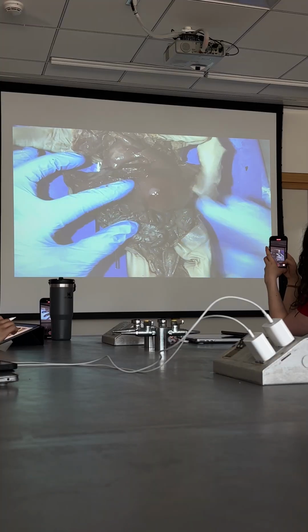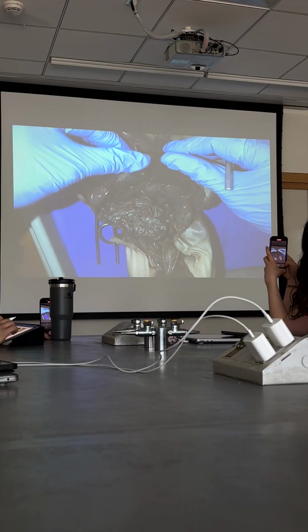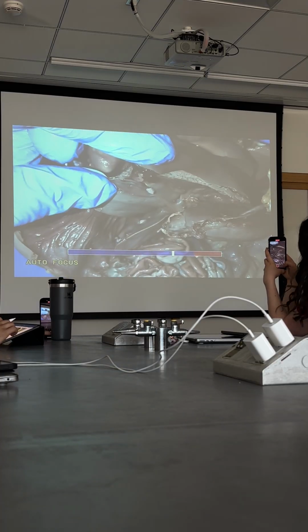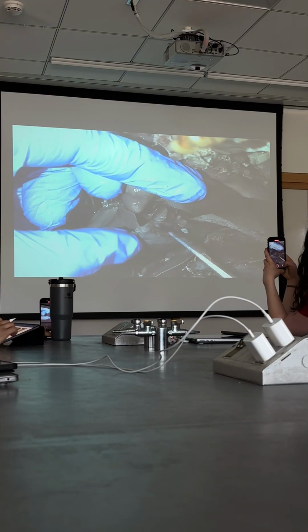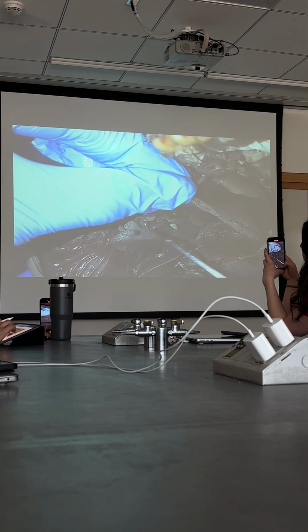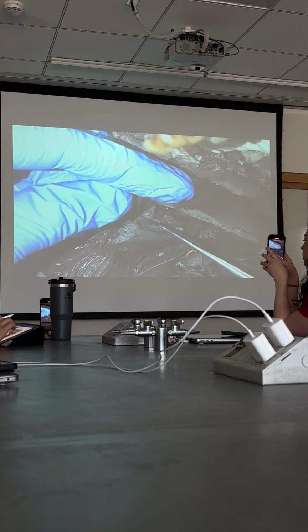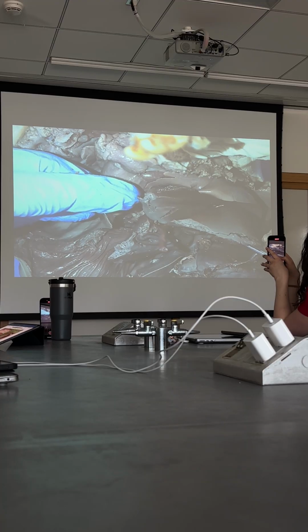You've got this whole big thing, which of course is the liver. If you retract the liver and look on the underside, sitting right there, okay, that's the gallbladder. Sometimes it'll look a little more greenish than it looks here, but anyway, that's it, sitting on the underside of the liver. It's usually pretty firmly attached to the liver, and when you take somebody's gallbladder out, that's the toughest part, carefully removing it from the liver without making the liver bleed a whole bunch, right? All right, small intestine.